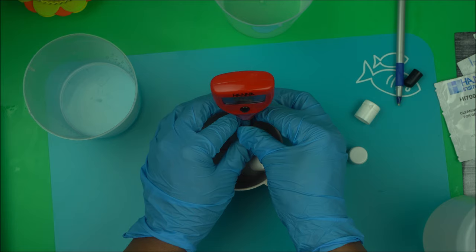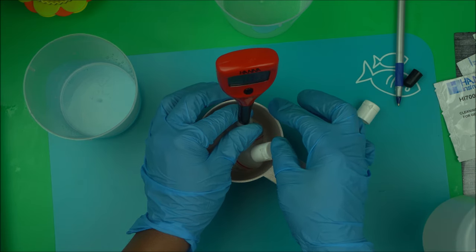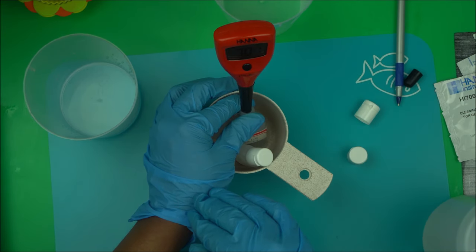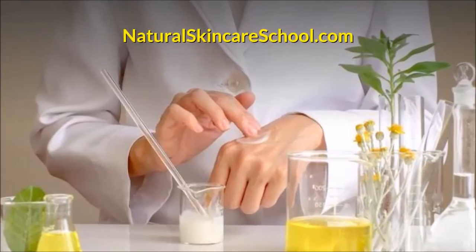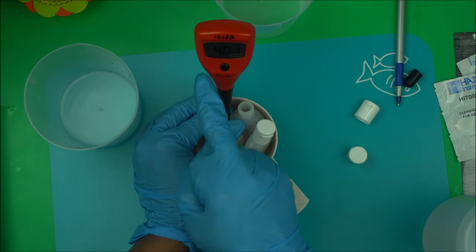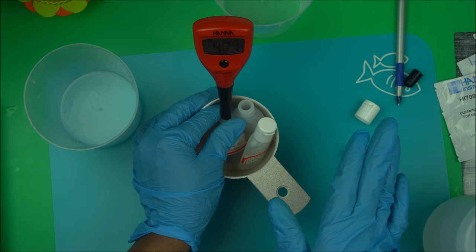Make sure you put the probe in correctly — just like I'm putting it now — into whatever pH range it's telling you. I have it in the 7.01 buffer solution. It will tell you to stop when it's done, then you remove it and follow the prompting. It's going to tell you to put it in the 4.01, so dip it in the 4.01 and wait. The indicator will be blinking throughout; when it stops, you are good to go.